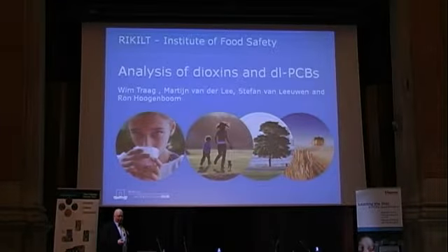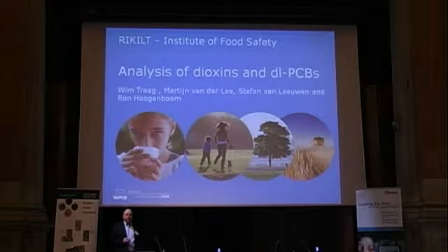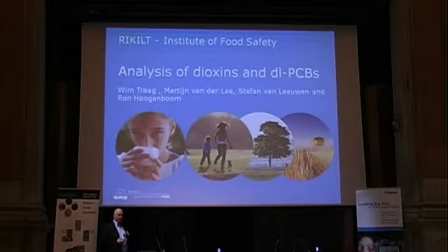But as technology is moving on, we are discussing within the EU NRL network the use of other, let's say, alternative MSMS technology. And Martin already gave a short presentation about MSMS this morning. I think it's very promising, and hopefully in mid-May we will finalize a draft proposal to the European Commission about the use of MSMS technology, not for screening only, but also for confirmation.